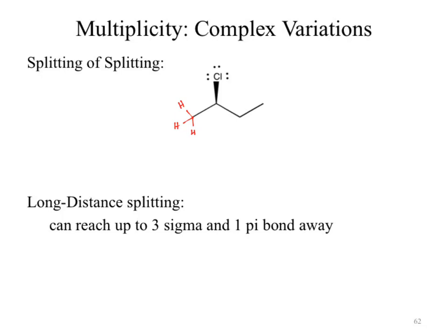Why am I showing a different color for each of my hydrogens? These are different signals, so that can help me go through and do my interpretation. We're going to start this one simply at first, and then we'll make it more complex in a second with that signal information that we talked about earlier. So let's start with our red hydrogens.